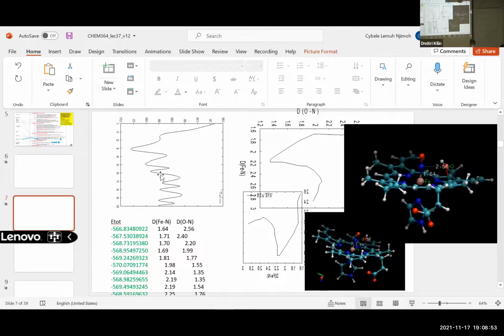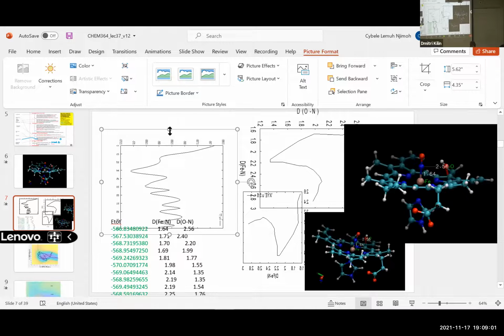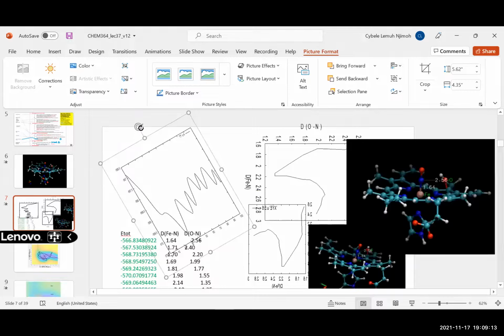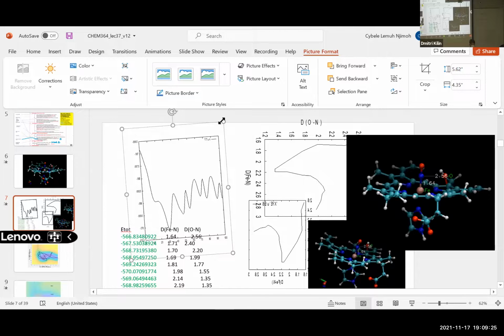Yeah, click on this image and rotate it. Here is a little rotation, but you can fine tune it to higher quality. Let me try doing it, rotating more, and making it fit the size.